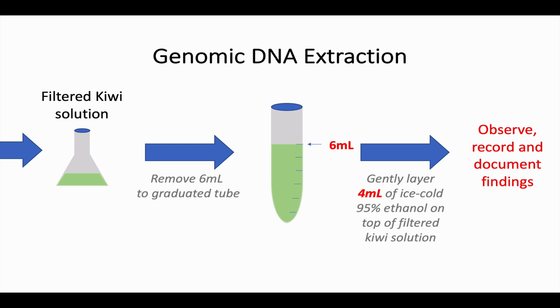So keep an eye once you've added the solution, where the two solutions are meeting. I want you to keep an eye on that over the next few minutes once you've added that ice cold 95% ethanol and see what happens. Okay? You should begin to see your DNA precipitate at that point. Your instructor will be able to guide you exactly on what you see and what you're actually visualizing at that time.